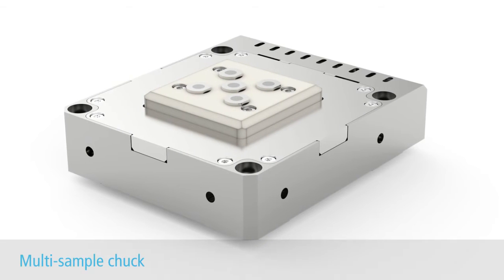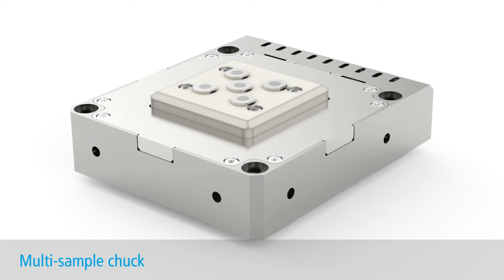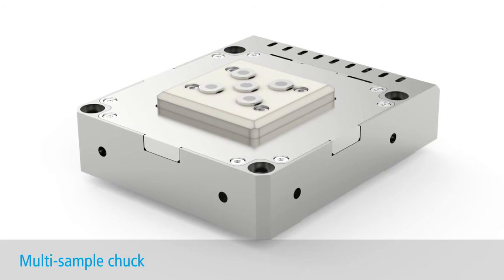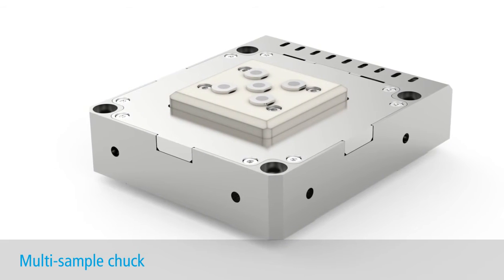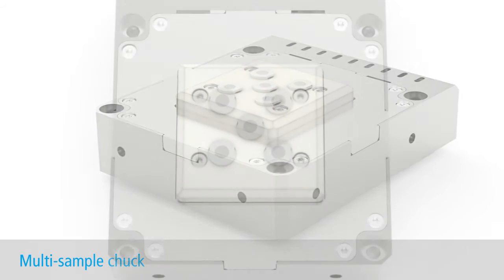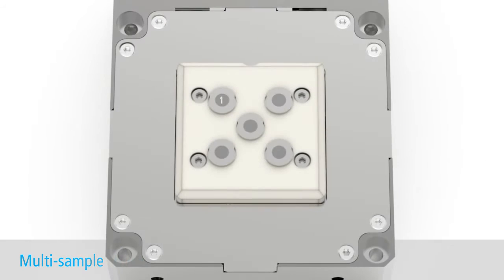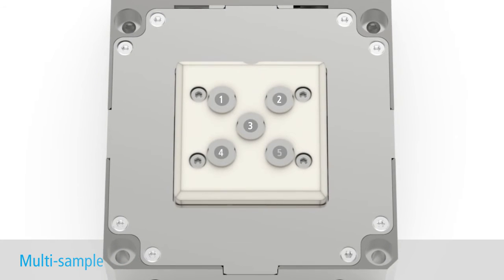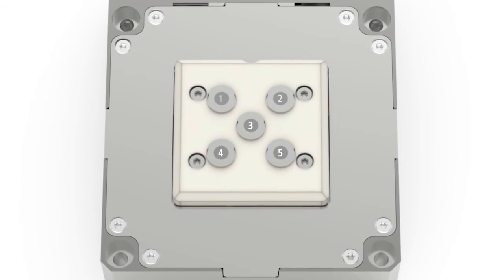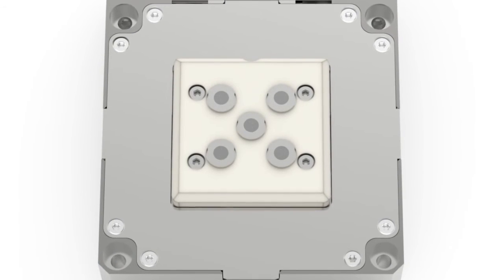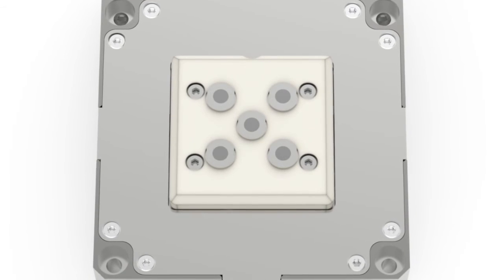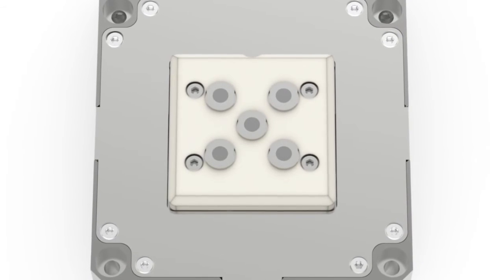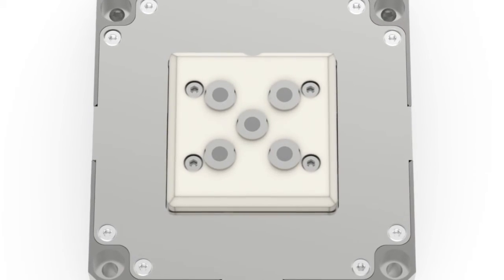Here is the multi-sample holder. It has the ability to mount up to five samples simultaneously. That's five different samples you can investigate at a time without the need to do a full vent and pump cycle, saving you a lot of time.